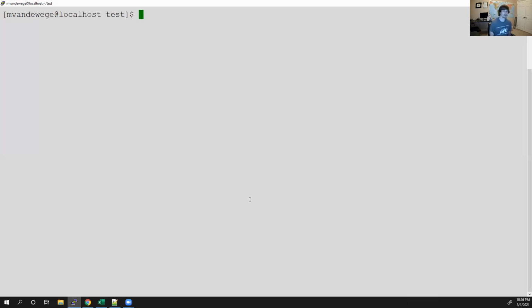But in this tutorial of playing with coordinate files, we're also going to learn another special character and a way to use grep. I think overall we'll probably learn about three new commands here, to not only demonstrate the power of Linux, but also demonstrate some basic analysis of coordinate files.